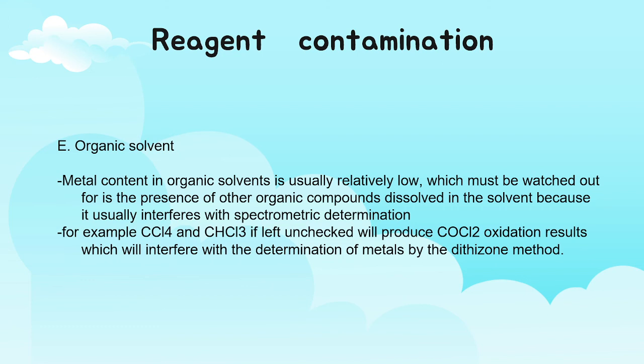For example, CCl4 and CHCl3, if left unstabilized, will produce COCl2, a toxic result, which will interfere with the determination of metal by the dithizone method.